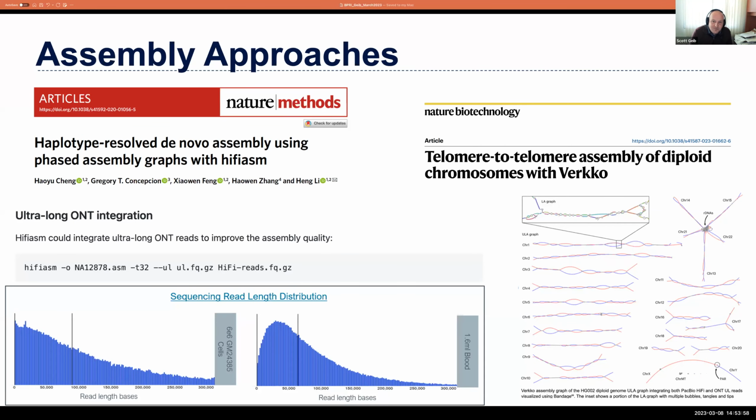That's going to depend on sample quality. That's where your extraction method is going to matter, and how much DNA you have going into it. How many small things, right? Olga said those small things get sucked up by nanopore immediately, so you've got to get rid of all the smalls. So in a production scale, how is this going to come out? I think most of it's going to have to be modifications or improvements to the sample processing to increase this.